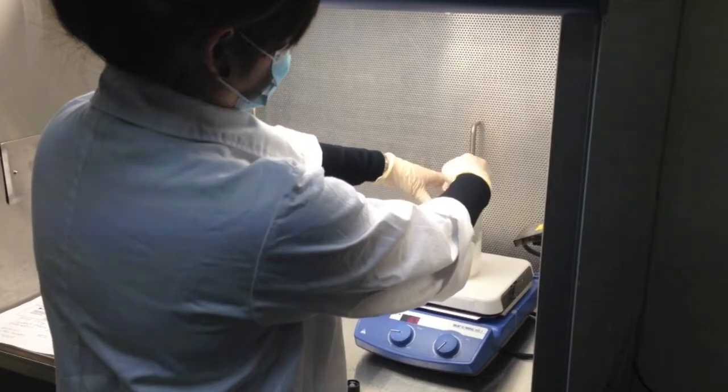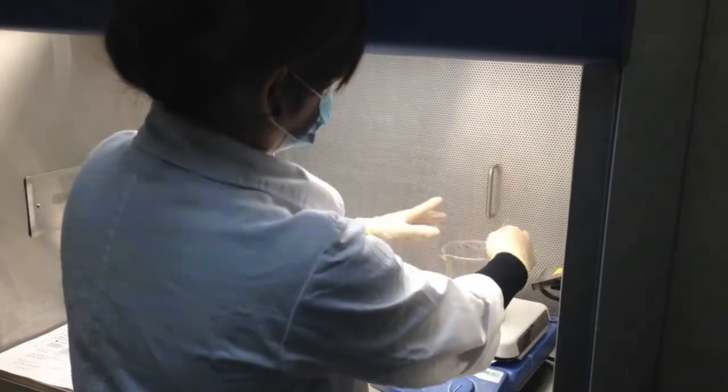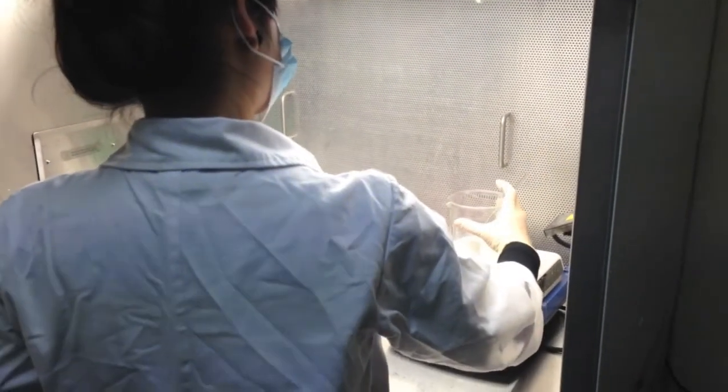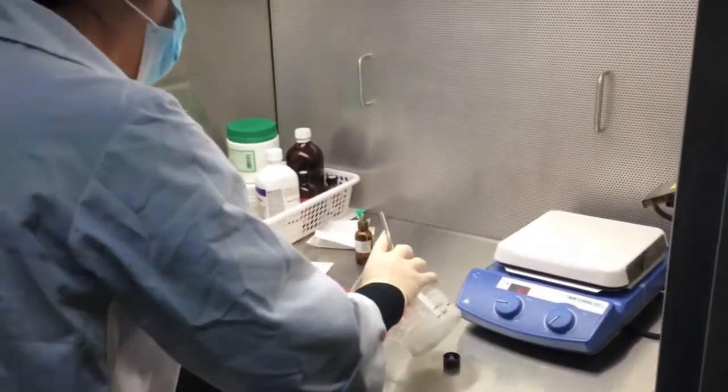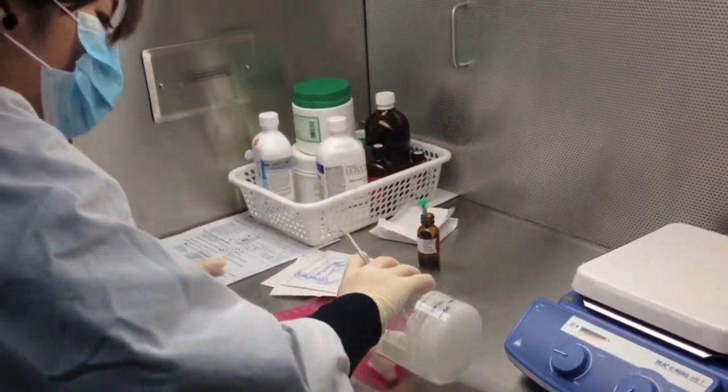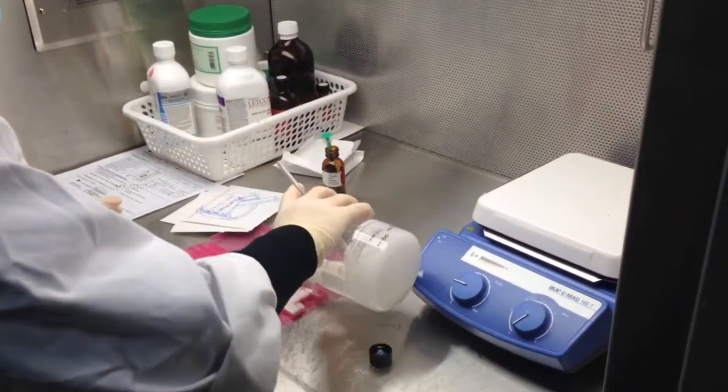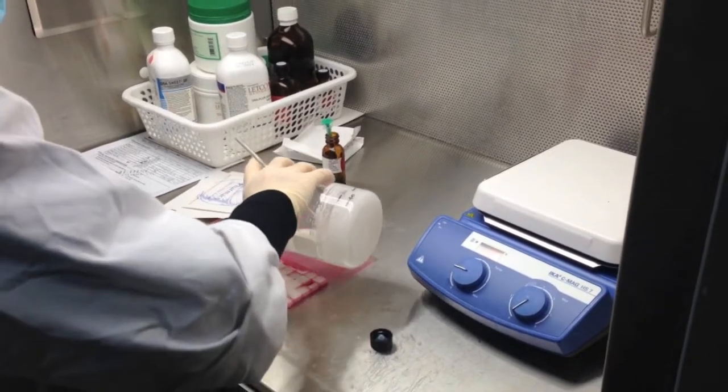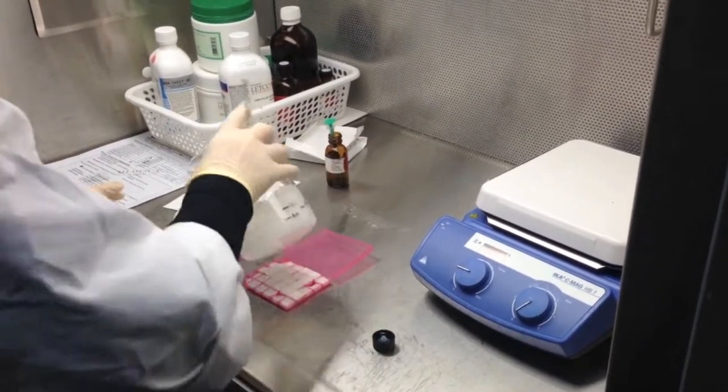Once a homogenous mixture is achieved, it can now be poured into the troche molds. Each of these two troche molds holds 30 troches.